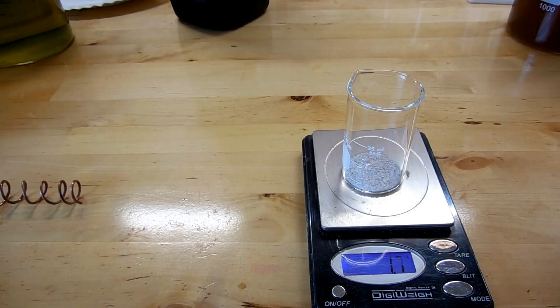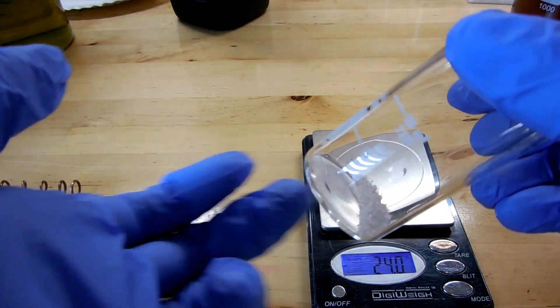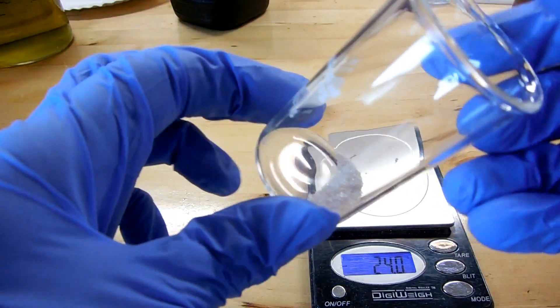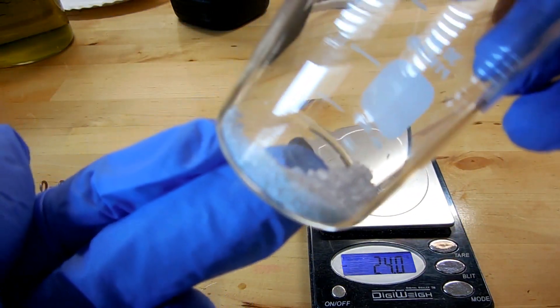Slightly over, but that's all right. And it's probably a good thing, actually, because silver nitrate is supposed to be snow white. But I don't know if you can tell, but my silver nitrate is actually gray.